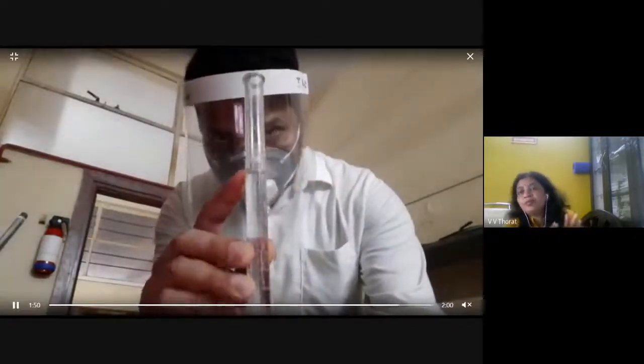And now you will start the next part. Next part is your titration. So sir will fill the burette first. This is the burette, 50 ml burette. You will fill it with EDTA. If madam gives you 0.01 molar, you will fill with 0.01 or 0.02. See, sir has filled the burette.